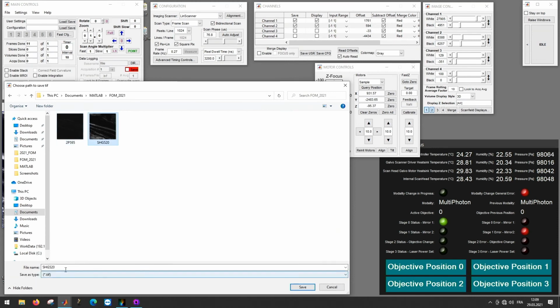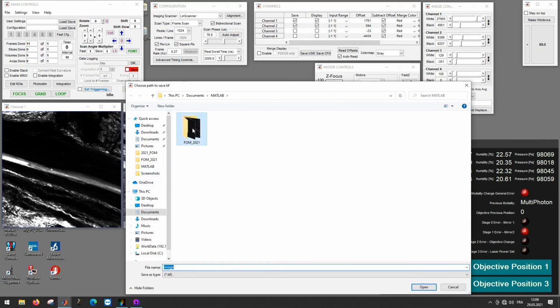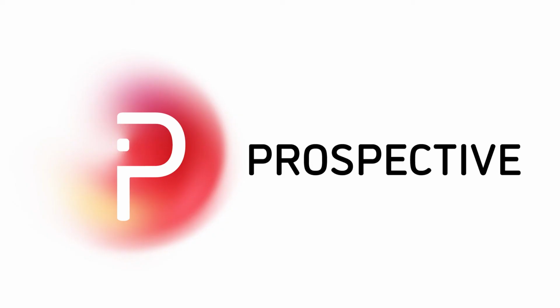It's again the SHG with 10 averages and the two photon with 10 averages. You can find all of the images, as I said before, on our website. And yeah, that's pretty much it. Let's turn on the light again. And I can pass back to Lukas.